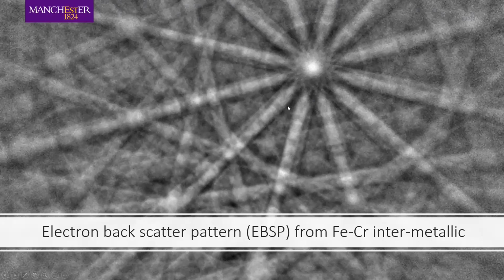The zone axes aren't, as opposed to how people thought initially that they were the important points in the pattern. But one aspect to think about is that these bands are actually a physical extension from the sample. So if you were an electron sitting on the specimen, hit the specimen, and then went to the detector, you would actually follow these lines. So these lines are formed in real space, so to speak.